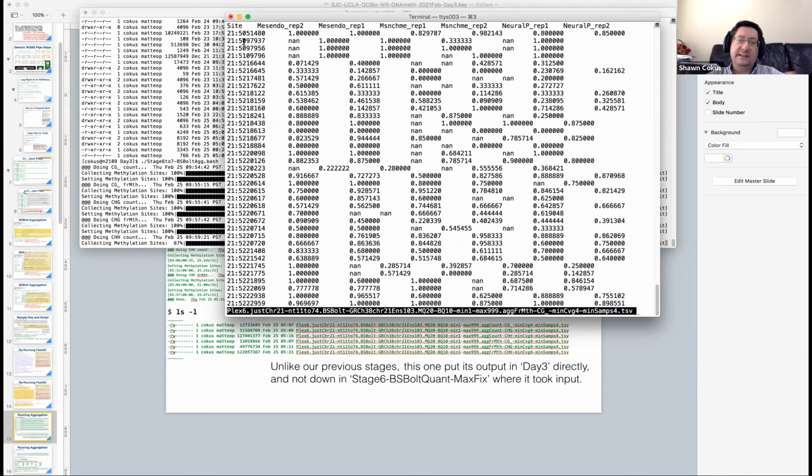But it's easy. If we need to get this back into two columns and change the colon to a tab to split it out into two columns, we can do that. If it was two columns and we needed to go to one, we could do that too. It just had to make a decision about which one we're going to do. The other one is easy to convert to. So the chromosome:coordinate is packed into the first column. And then we have 6 samples: 1, 2, 3, 4, 5, 6.